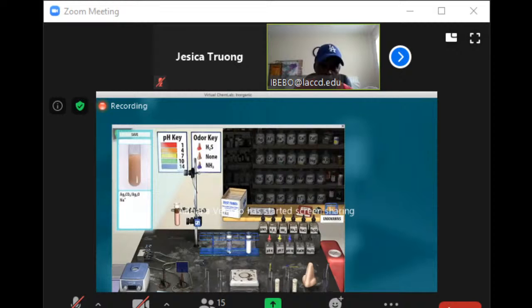With that antimony, is it a clear solution? No, it's a white one. Is that a white solid or white solution or white what? It looks like the antimony hydroxide is a white solid floating in its solution. Oh, okay. So it looks like a white solid. Yeah, and so then you start again now to number 3.